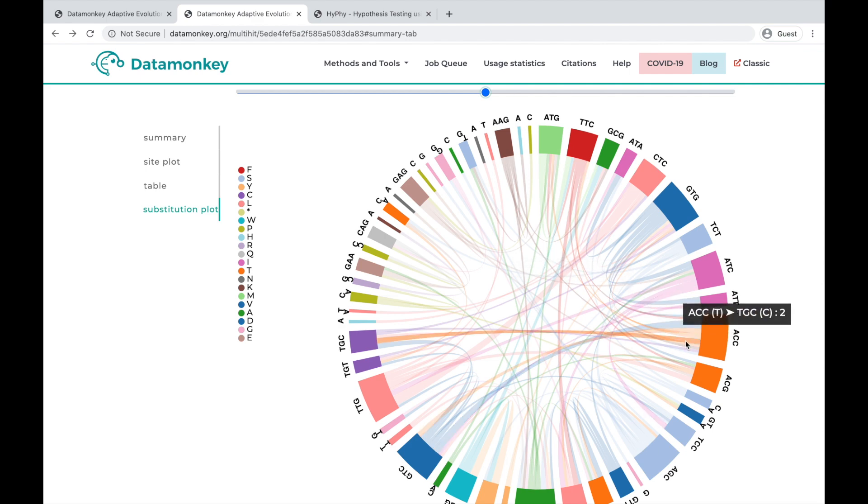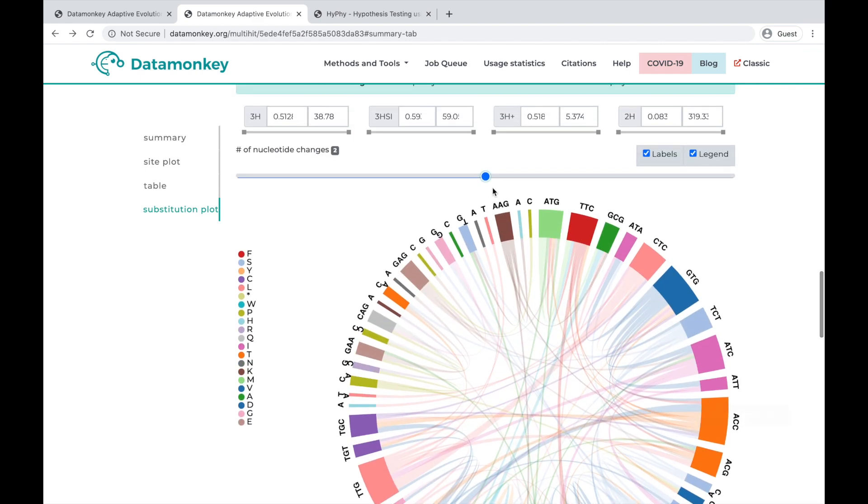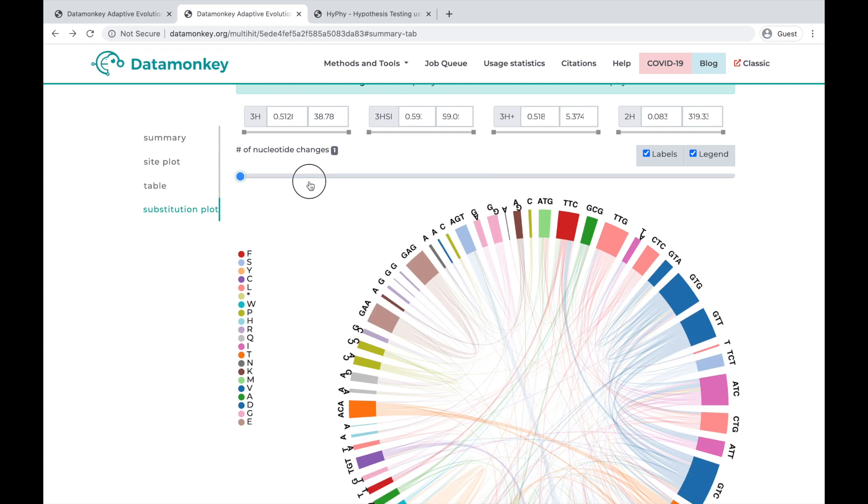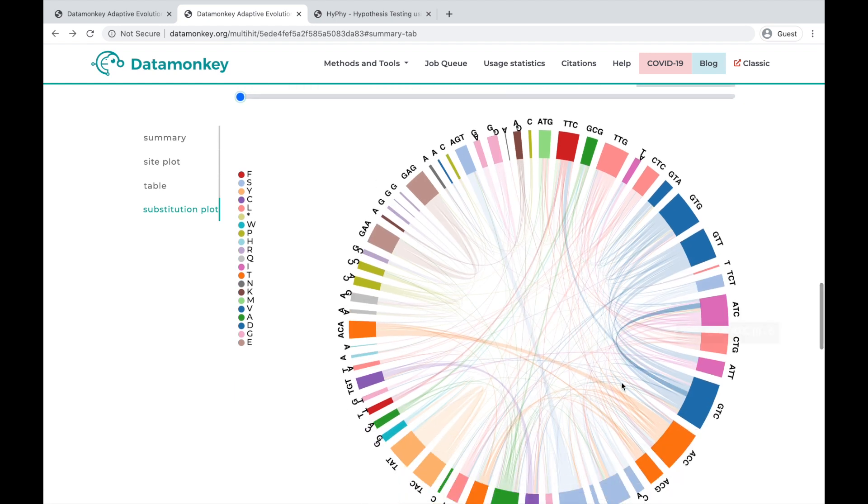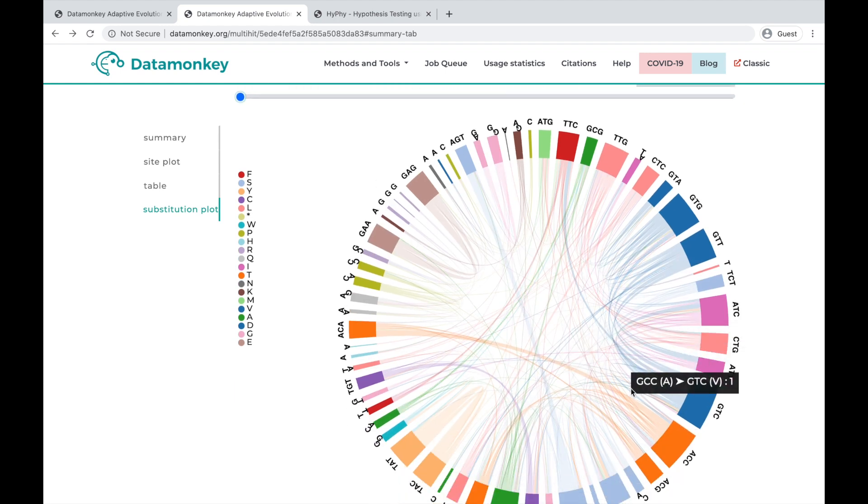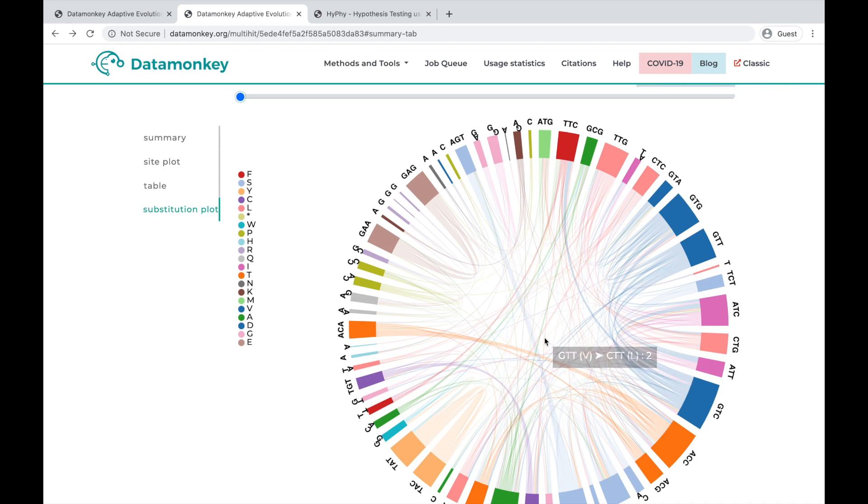There's a lot more diversity, and you can crank that down to one and see there are a lot more single nucleotide changes.